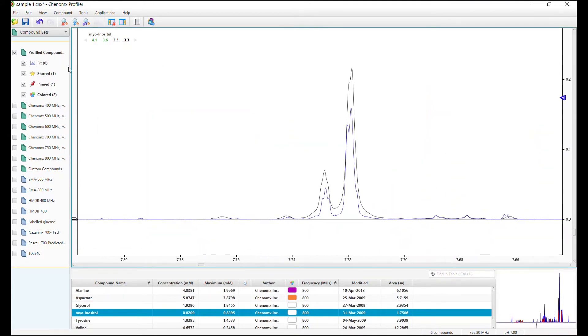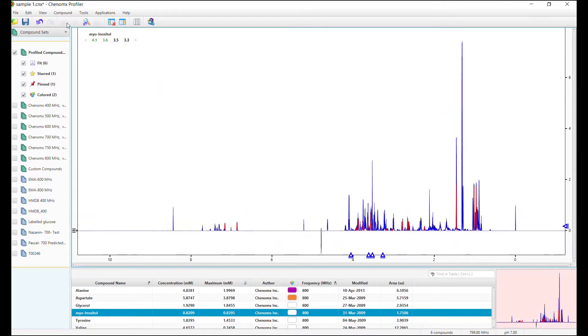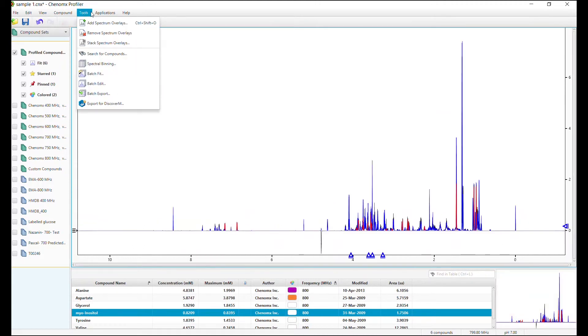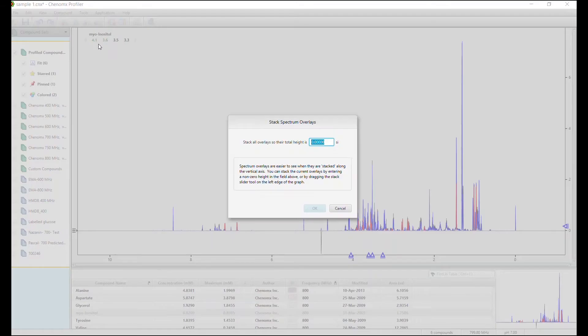You can also move up the baseline of your overlaying file for an easier comparison. Tools, Stack, Spectrum Overlay, and you can add a distance value here.